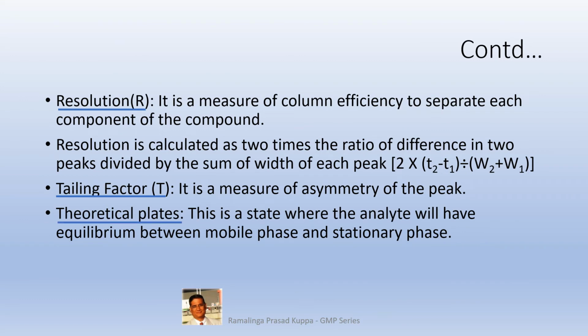Theoretical plates. This is a state where the analyte will have equilibrium between mobile phase and stationary phase. Theoretical plates are not physically present to count. For easy understanding, it can be stated that a theoretical plate represents the distance that is required for every adsorption and desorption step.